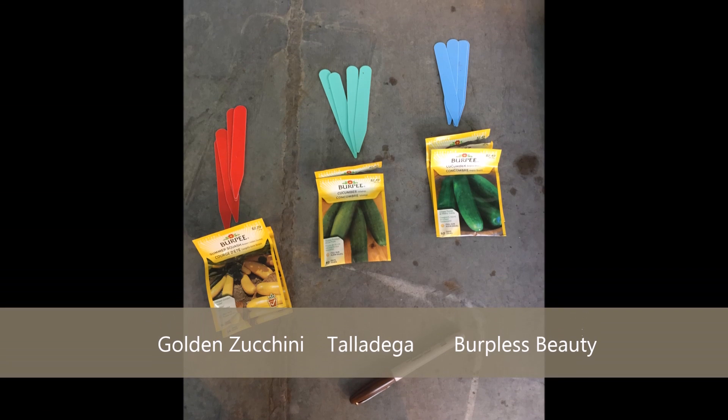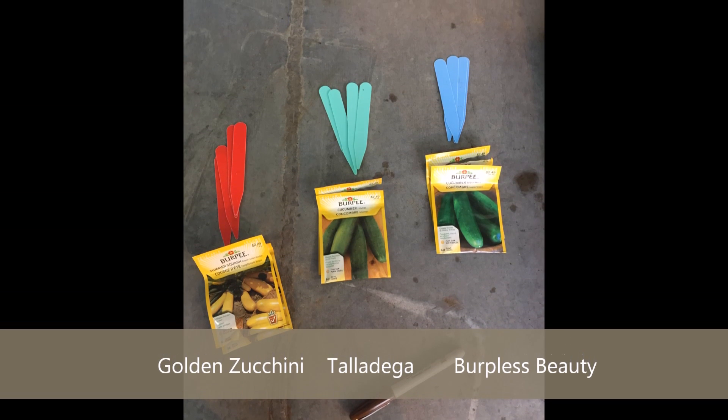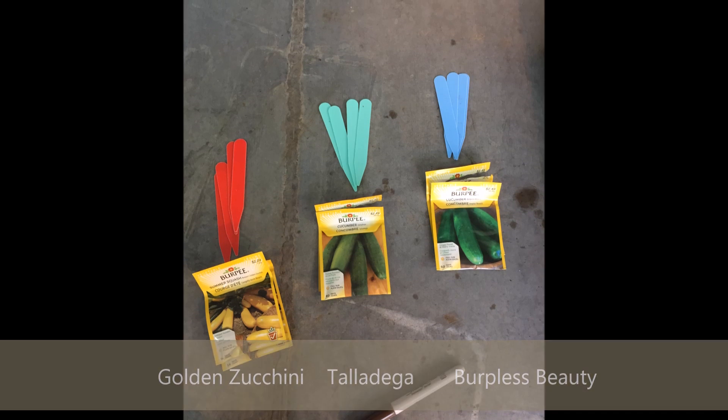In this experiment we will see if cucumber species can take advantage of the larger and deeper rooting system of squashes.